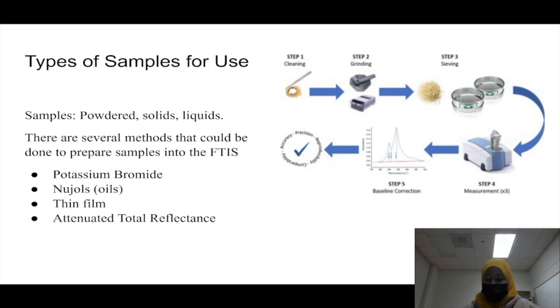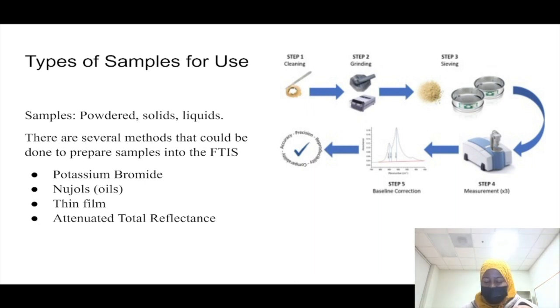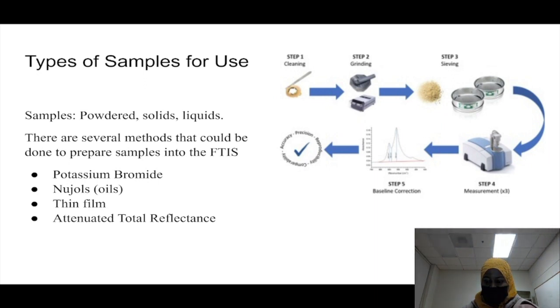For example, when using an animal bone, the specimen is ground using a grinder at 20 Hz for 20 to 25 seconds. This is done for 3 to 5 times, and specimens can also be ground with a pestle and mortar. KBr is added to mix the sample, and once the sample is ground, it is then sieved and put into the device.